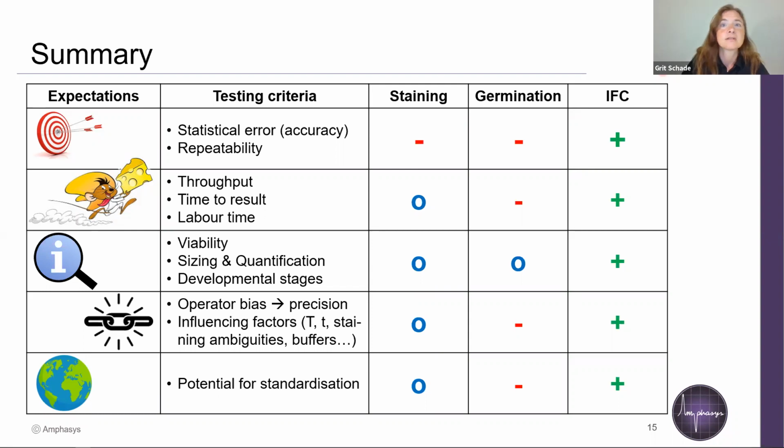There was another question about the technology at all. Have we tested plant protoplasts for viability? I can just answer yes, we have also measured plant protoplasts, and we can also check them for viability. Exactly, and of course, you can reuse the cells after measurement. This can be helpful for protoplasts, for example.